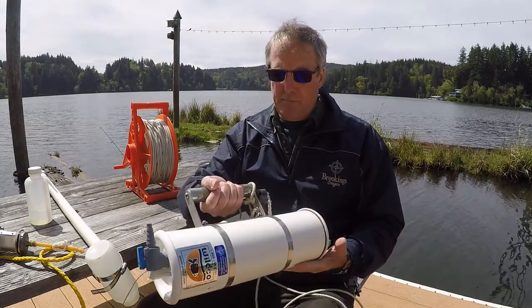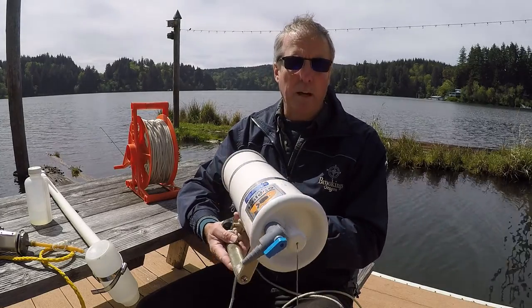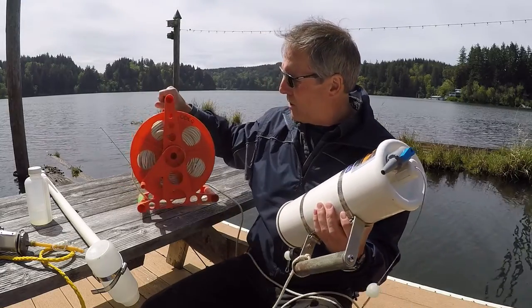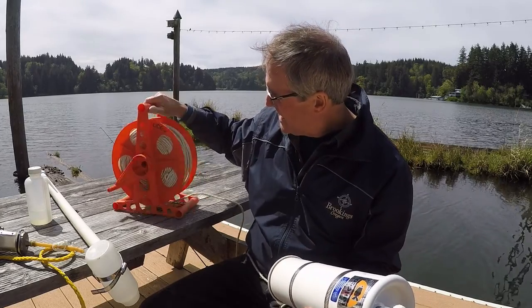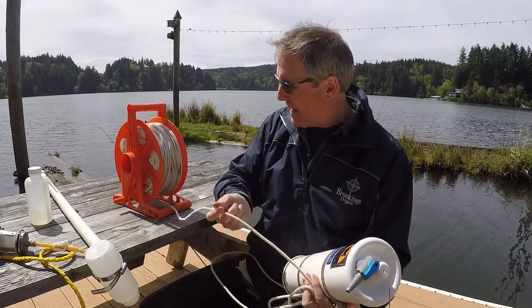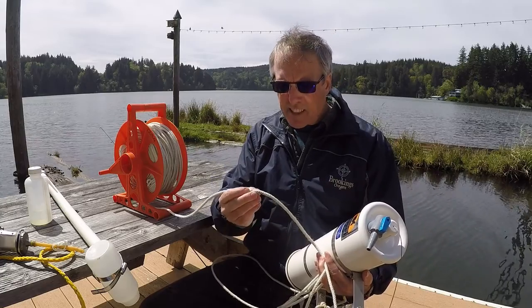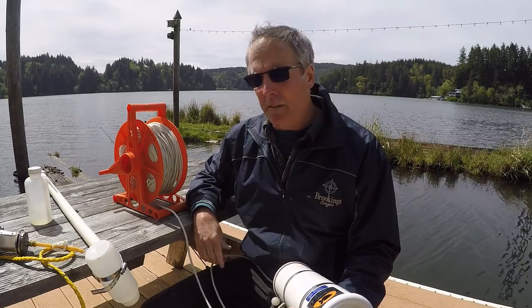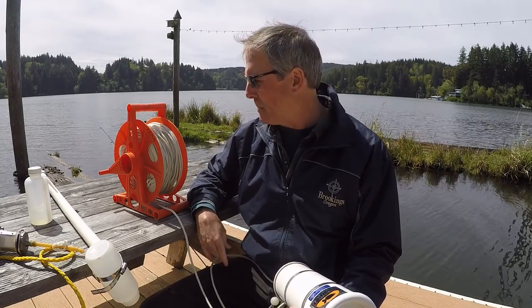Okay, so the Van Dorn bottle is a really handy item. We have the cord on this. You can tell we have this from the DEQ. The cord itself is actually metered out, so we can tell how deep it is. We need to redo the marks, but there's a mark right there, and that'll help you easily determine how deep you are at the same time that you're doing your sample.